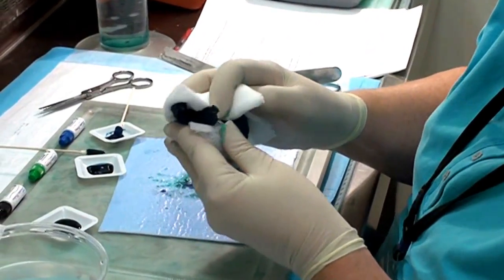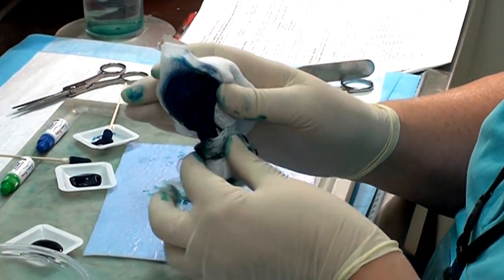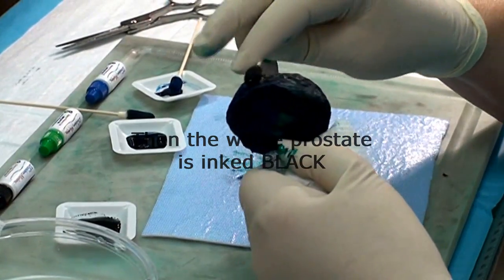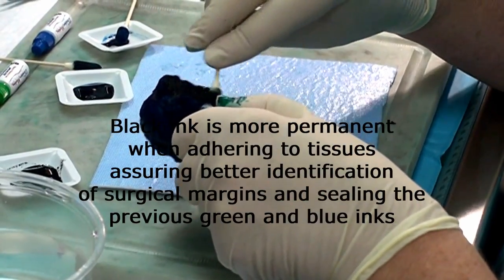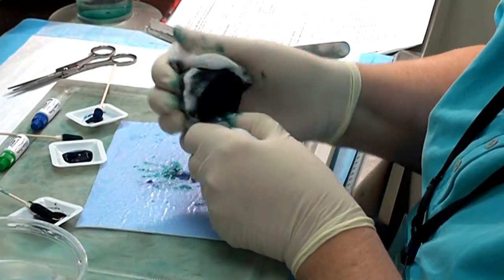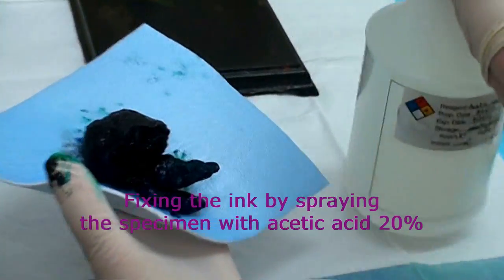We're going to use the gauze to get off any excess ink. We're going to hold the specimen by the seminal vesicles and apply black ink to the gland itself. Use the gauze to get off the excess. Just a light spray on both sides.